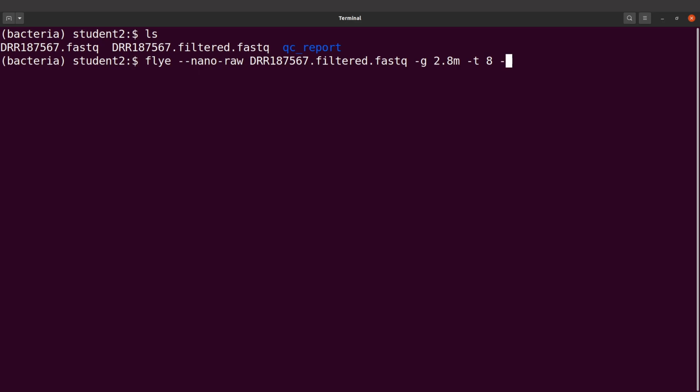All right, let's also indicate something else. You will say -o to specify the output directory. So I'll say assembly. You can use any name of your choice. That's it. With Flye, it also allows you to do polishing. If you want to do some polishing, you can add a -i and specify the number of rounds, maybe 1, 2, or 3. And that's up to you.